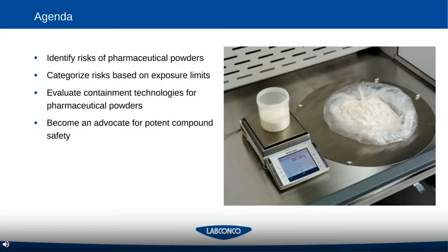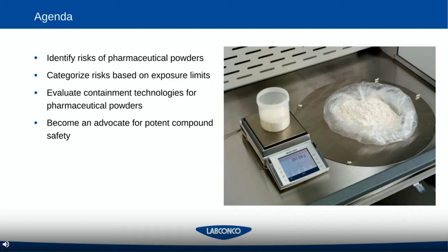Today we're going to talk about key parts of assessing and integrating any type of powder containment device into your laboratory practices. We'll start by looking at risks of pharmaceutical powders — their characteristics and what makes them hazardous to human health. We'll also spend some time categorizing risks based on exposure limits, talking about OELs and OEBs. Later we'll talk about evaluating containment technologies — the different types of enclosures and isolators available — and ways you can become an advocate for potent compound safety in your laboratory and greater manufacturing environment.